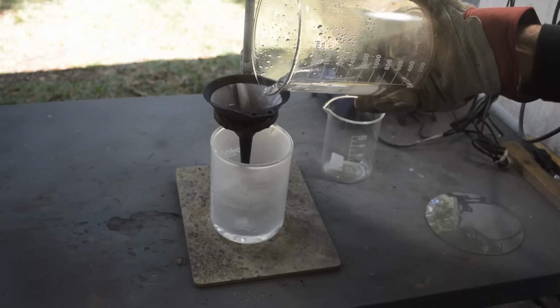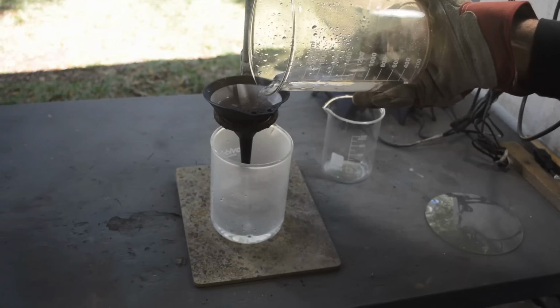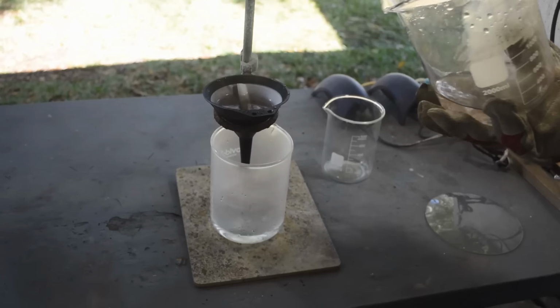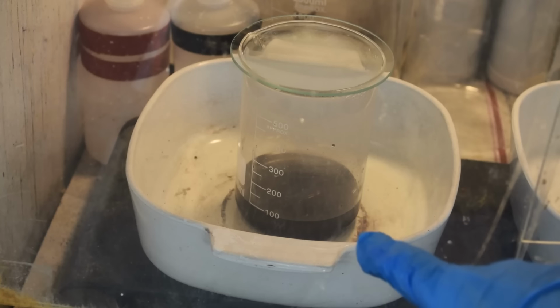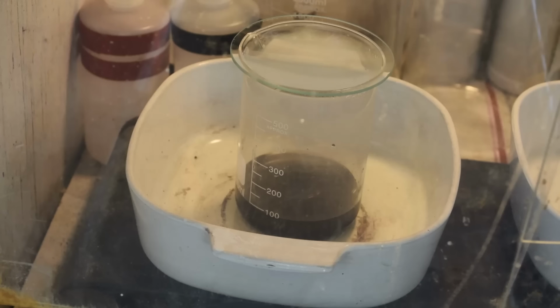Be back when I've transferred the gold over and we're ready for further cleanup boils. Okay, we're back in the fume hood in the smaller beaker. Got some muriatic acid on there. We're going to boil it again. Then I'll drain that off. We'll give it some water boils, dry it out and weigh it. Hopefully there's enough there to get a good weight on.